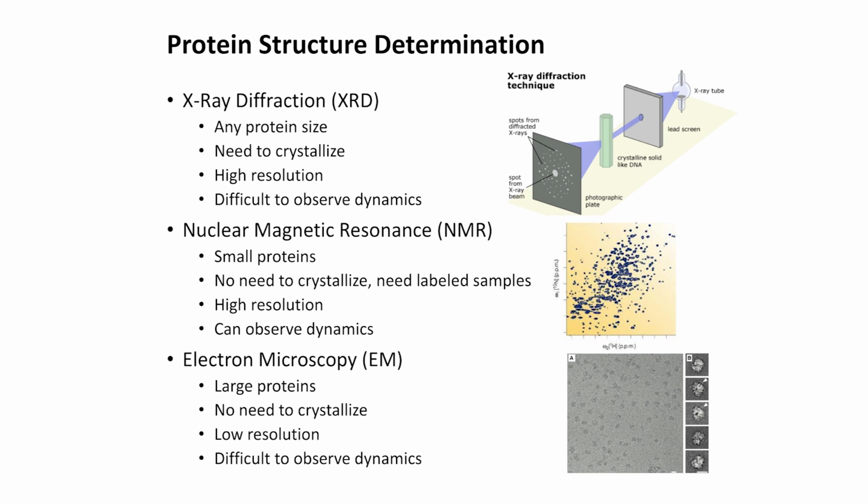You can obtain a high-resolution picture with NMR as well, but it often requires more work than X-ray crystallography, in that you need to do about, say, 5 NMR experiments that can sometimes take months to determine a high-resolution structure. But really, the big upshot of NMR is that you can observe dynamics within proteins. You can really see proteins are living, breathing machines, and you can see that with NMR better than with any other technique. Another quick point, which I don't have written up here, is that NMR is sensitive to protons, and you can study hydrogens with NMR. You cannot study hydrogens with X-ray diffraction, for reasons I'll come back to later in the talk.